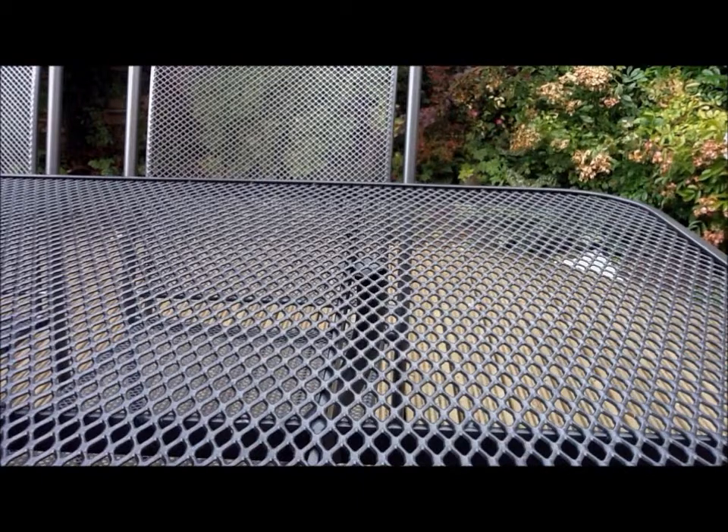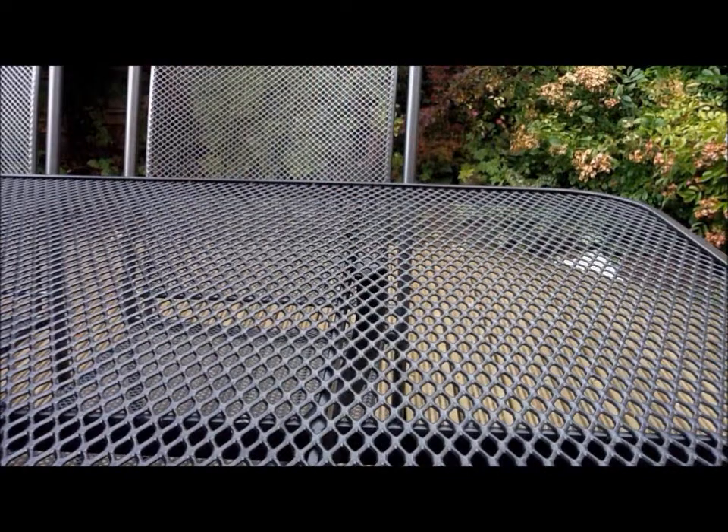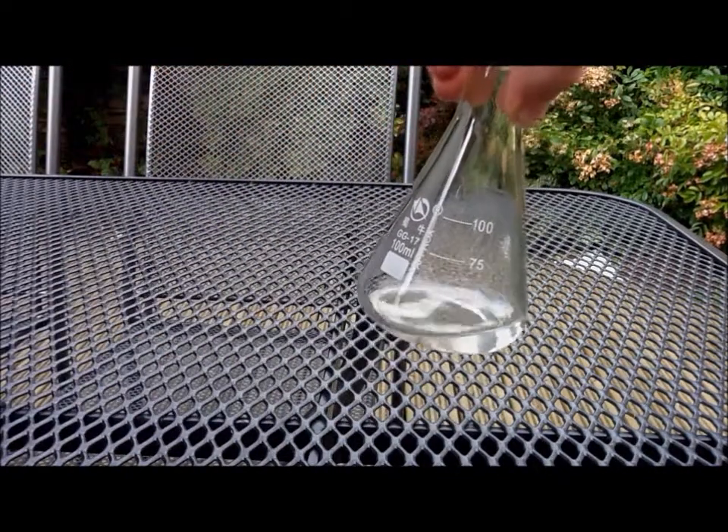Today we are going to be reacting hydrogen peroxide and potassium permanganate. For this you are going to need hydrogen peroxide, potassium permanganate, and a conical flask.